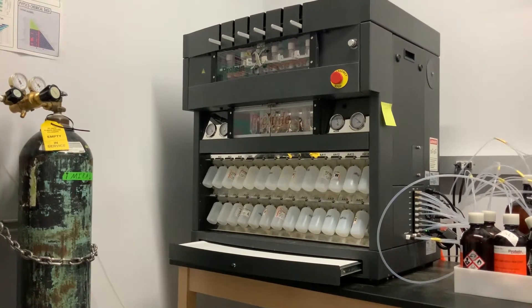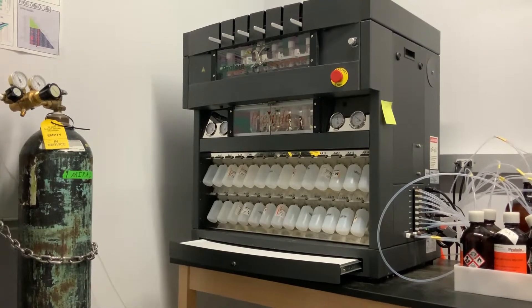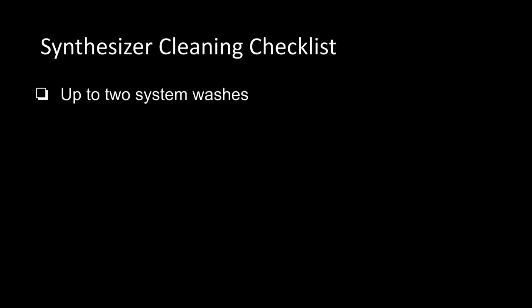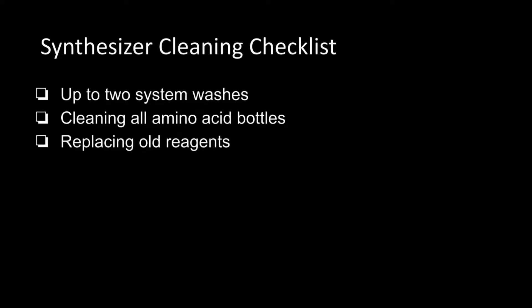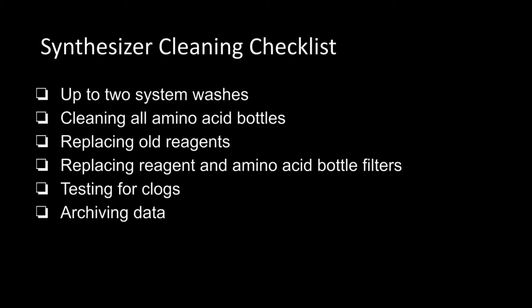If the synthesizer is being regularly used, it will need a full clean every month. This consists of the following: up to two system washes, cleaning all amino acid bottles, replacing old reagents, replacing reagent and amino acid bottle filters, testing for clogs, and archiving data.